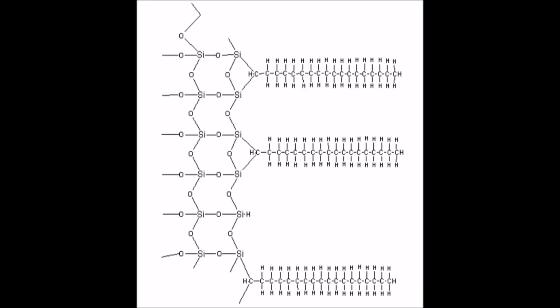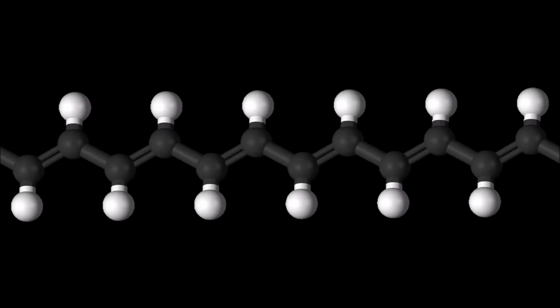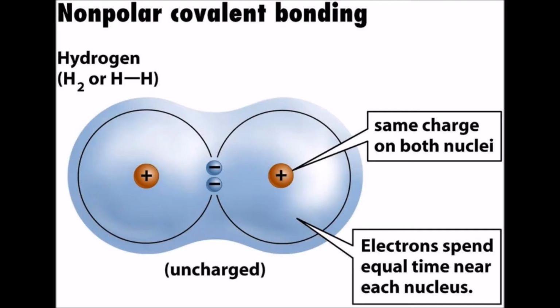Each of the particles has a coated surface of saturated alkyl carbon-18 chains, which exhibit nonpolar hydrophobic behavior. These properties instigate interactions with the sample, resulting in the partitioning of the analytes from the mobile phase as the mixture travels through the column.